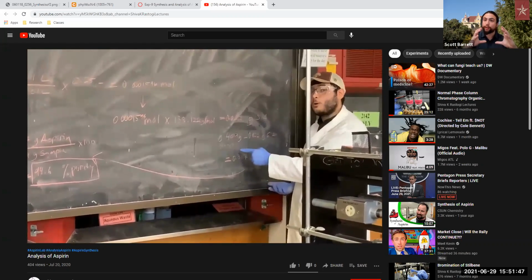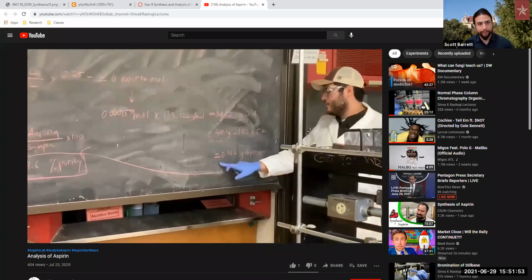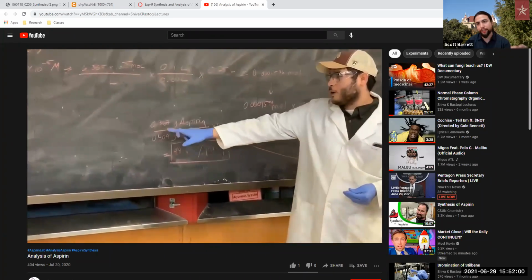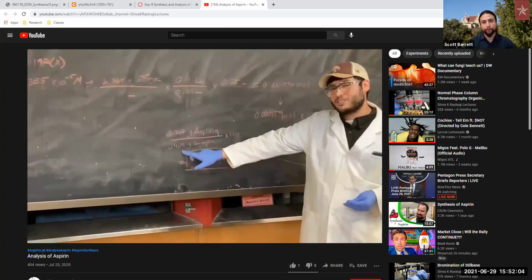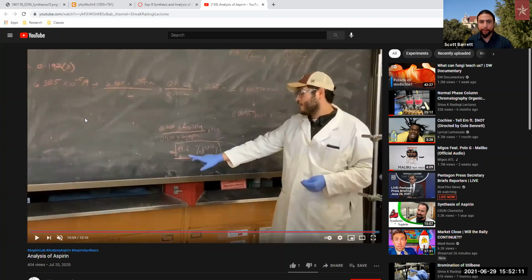So you take your full product, you subtract your salicylic acid quantity from it, and then you're left with your final actual yield. And then you can take the quantity of your actual yield, which in this case is aspirin, over the given total quantity of sample, multiply by 100, and then you have your percentage of purity. And in this case, it was 94.6%. So again, that is the primary math behind it, just to show you for a relative instance, Beer-Lambert law.